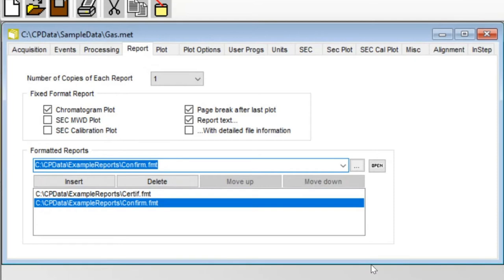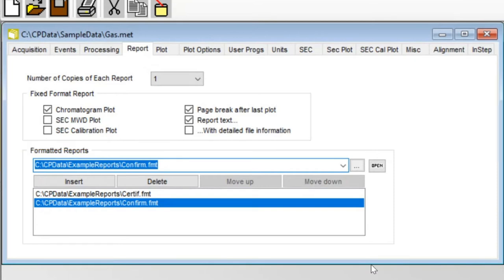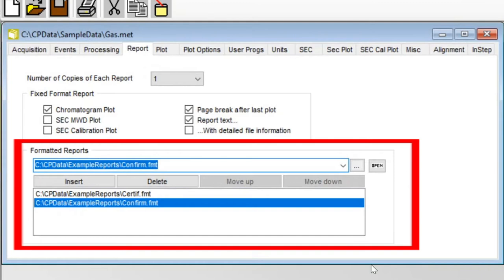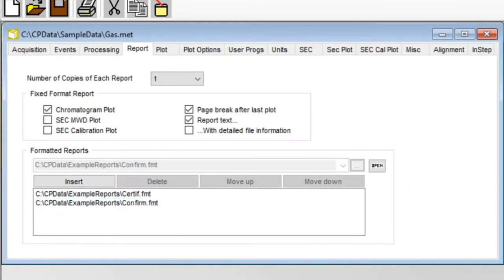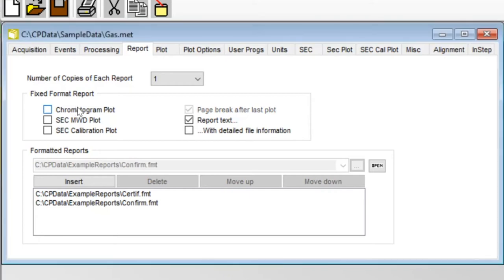There are two sections. The first deals with the production of fixed-format reporting, and the second is responsible for custom or formatted reports. To disable the printing of a fixed-format report at the end of every run, deselect the chromatogram plot and the report text checkboxes.